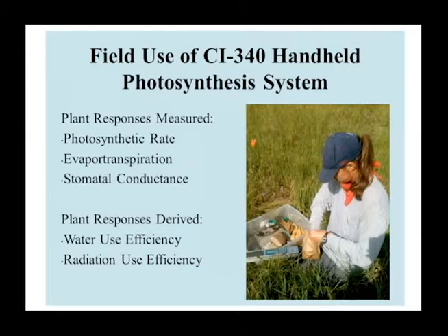Okay. So I measure these rates on the plants, and I'm looking to do non-destructive methods. Because we planted all these plants there, we don't want to sample them by taking their leaves away and running nutrient analysis on that. So we look at their physiological parameters, the photosynthetic rate, transpiration, and stomatal conductance. And from that, we derive the water use efficiency and also the radiation use efficiency of these plants. Next slide.